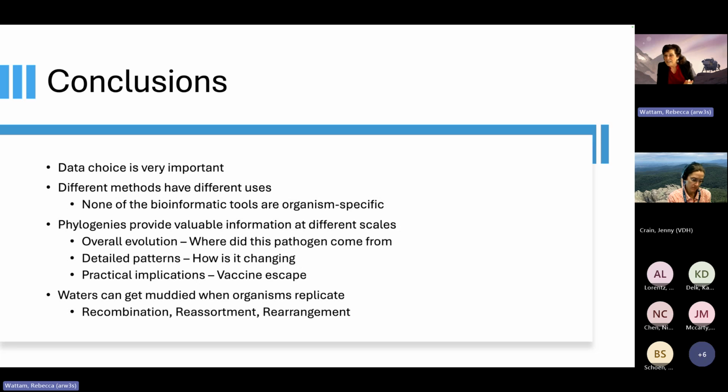So you're giving that a little bit more weight, and you can have 1,495 genes and 1,495 proteins, the sequences for the proteins and the genes, and you push them all together into this super long alignment, and you feed that to the tree building pipeline, and then the visualization at the end.